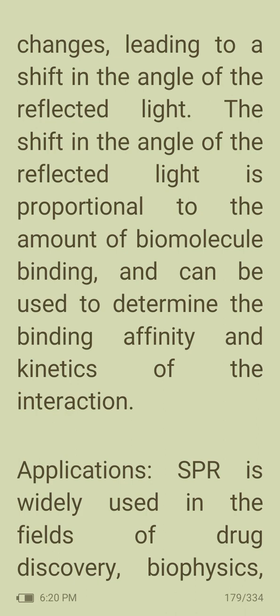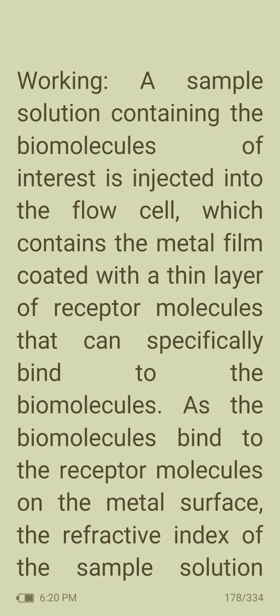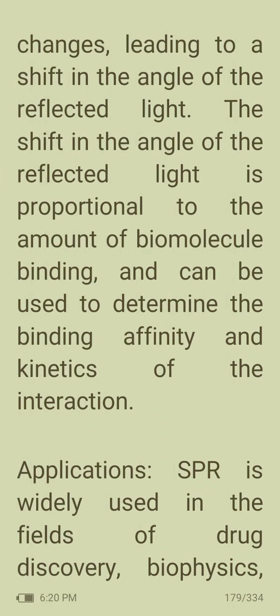So there will be a suitable receptor which is coated on a metal plate, and a flow cell will be there, and we are injecting the corresponding sample into that. There will be a binding occurring between the receptor molecule and the biomolecule. Then the refractive index of the sample solution will change accordingly.